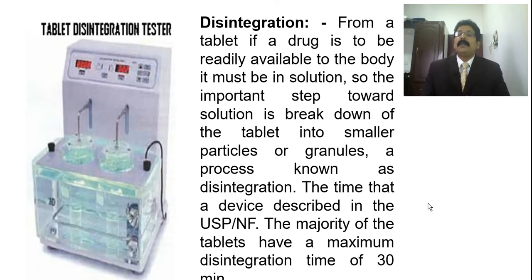Any tablet has to undergo the disintegration test. For a tablet, if a drug is to be readily available to the body, it must be in solution. That we know very well. It's a general point. So the important step towards solution is to break down the tablet into smaller pieces or granules, a process known as disintegration.